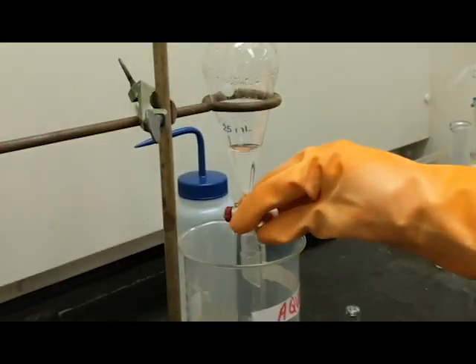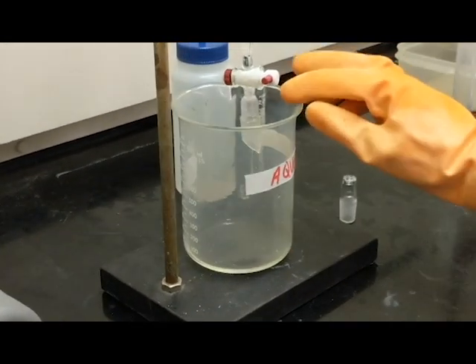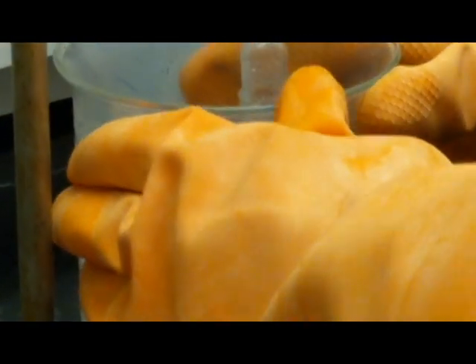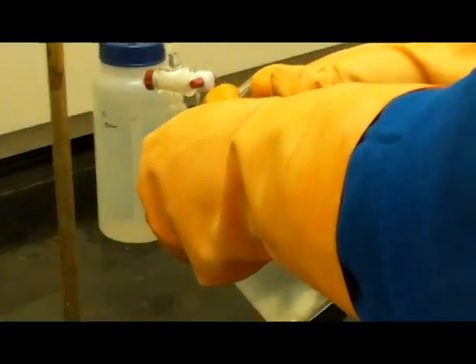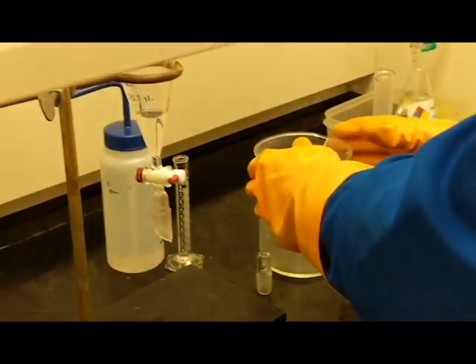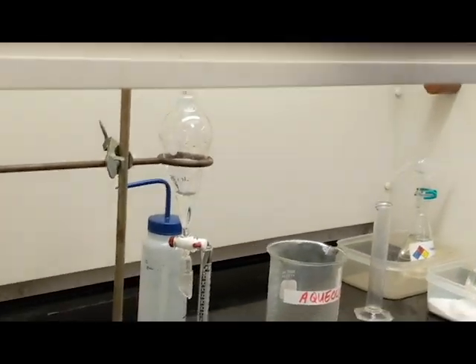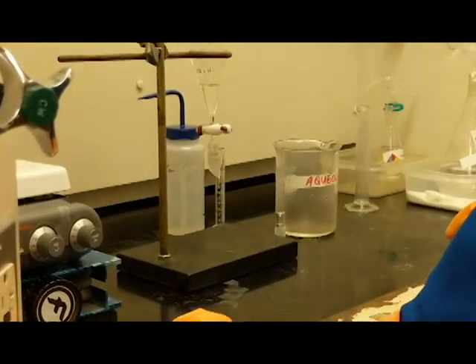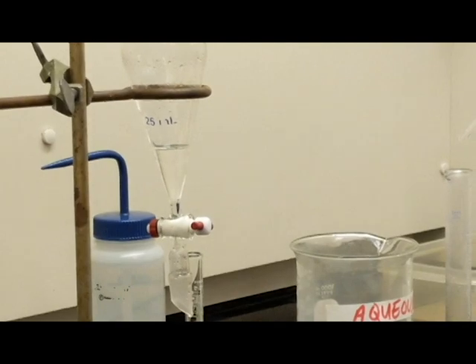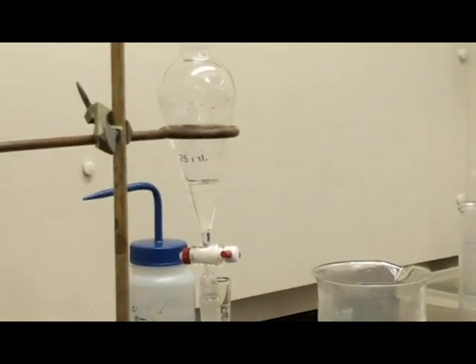Now this aqueous layer is very acidic, and you know that. You can see this condensation building up on the inside. So at the very end, we're going to tell you how to properly recover this aqueous layer. The next step in your procedure is to wash the organic layer with 10 mL of water. You're going to allow the contents of the funnel to stand until you again see two distinct layers.